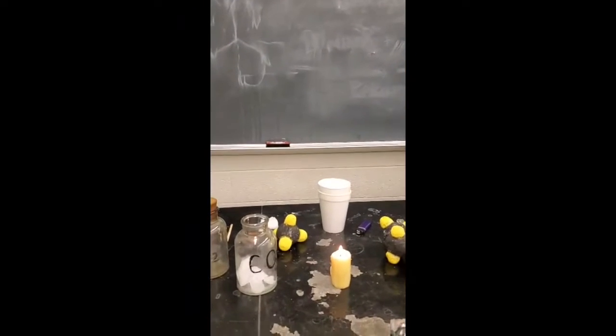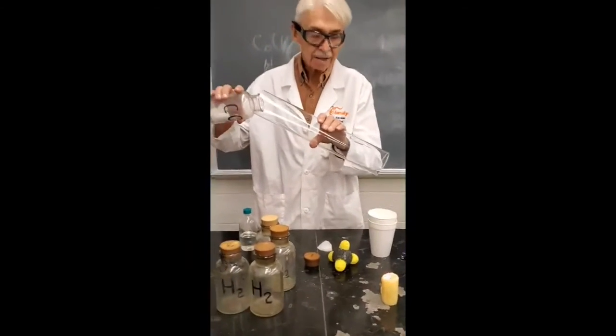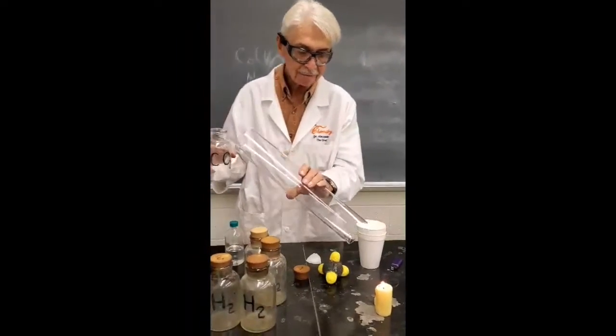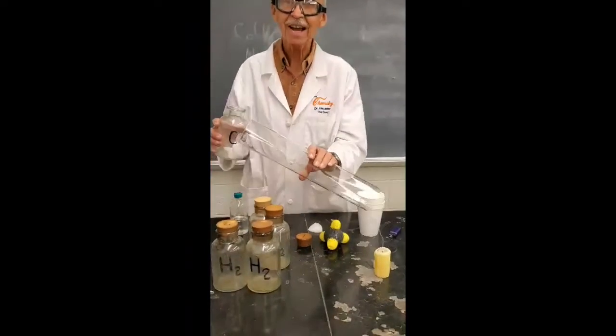And I think that I actually can pour this out of this bottle down this tube. And I think it'll come out the other end. How can I prove it? Oh, I know how. I should put that fire out, right? Let's see if it does. Is that cool or not?